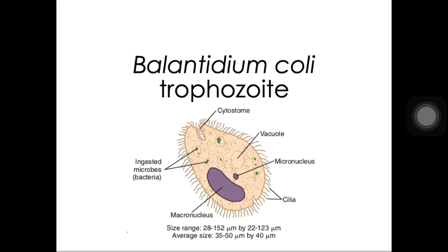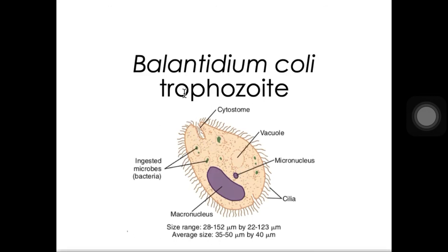Again, the trophozoite here, morphologically we can see here the presence of a mouth or cytostome. Syempre may cilia po surrounding it because this one is part of your ciliata. So we can see here two nucleus, no? Yun po yung unique sa mga Balantidium coli. We have presence of macronucleus and micronucleus. So macronucleus is for vegetative function, while micronucleus is for sexual reproduction. So again, we have here presence nga po ng cilia, cytostome, ayan, in addition to the macro and micronucleus.